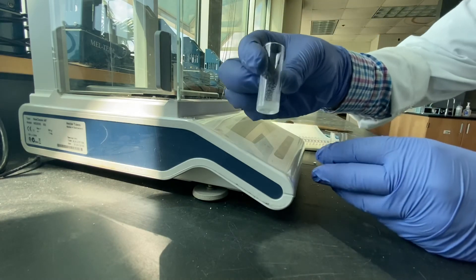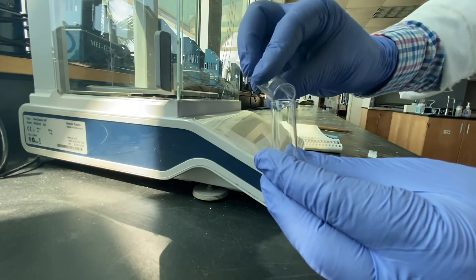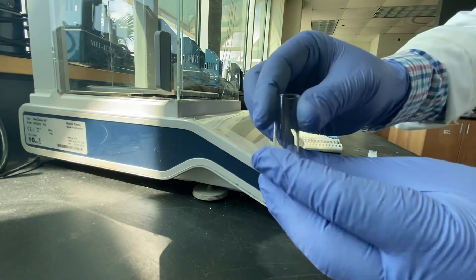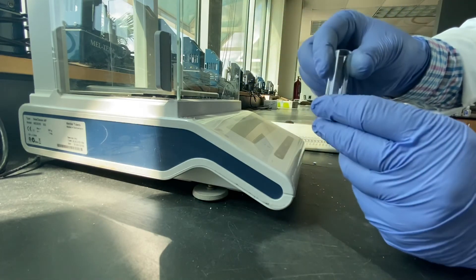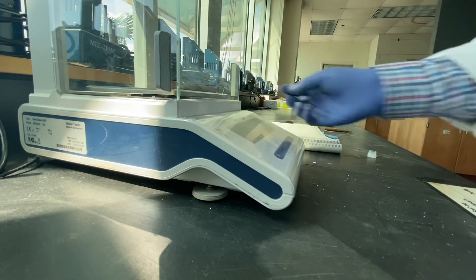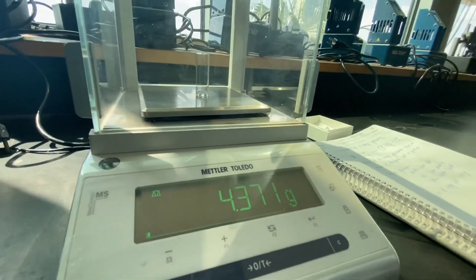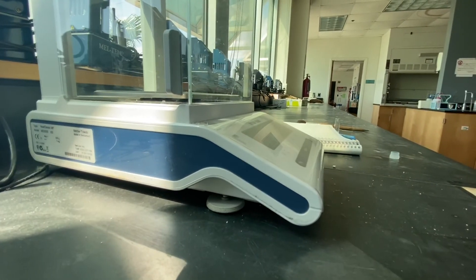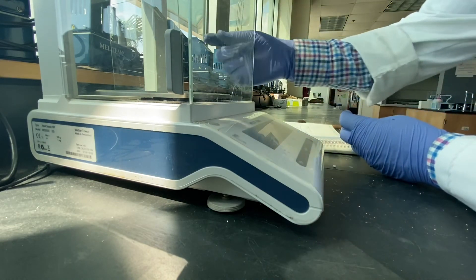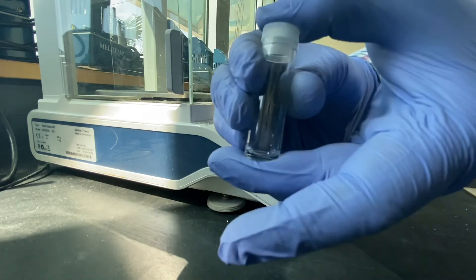Carefully take out the product liquid leaving the sodium sulphate, into this pre-weighed vial. This process is known as decanting. You can also use a pipette to take out the product leaving sodium sulphate behind, but either way be careful not to take any sodium sulphate with it. Re-weigh the vial and record the difference in weights as the mass of product formed. Observe the appearance of this final product and record that as well.